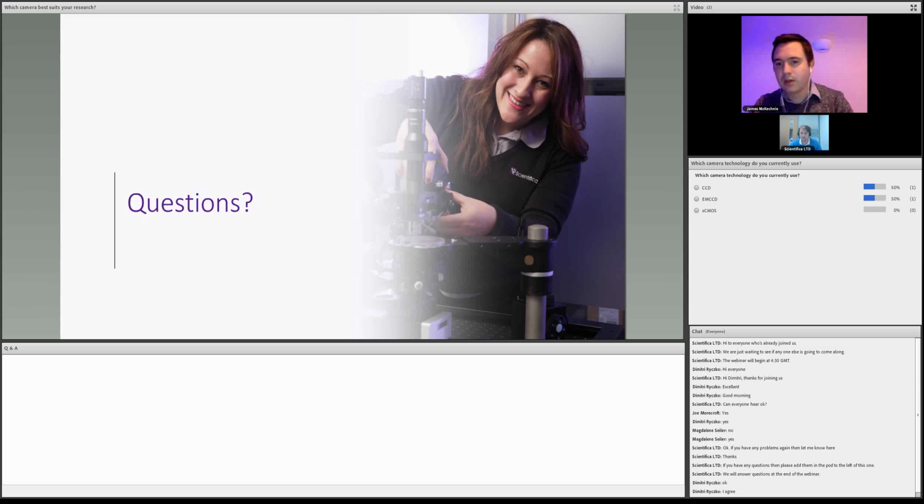For dual channel, you probably need to change the light source as well, or at least look at different ways of illuminating.